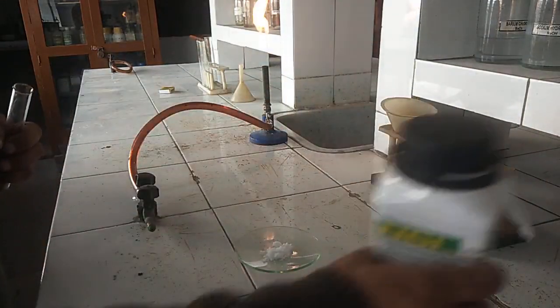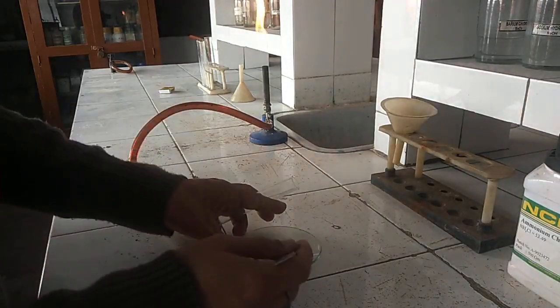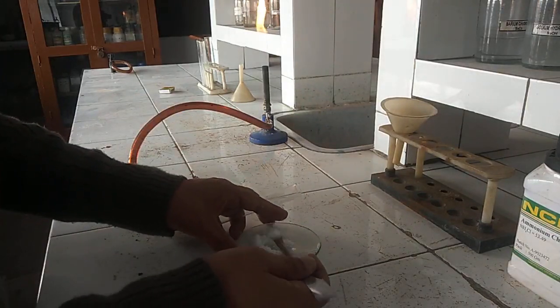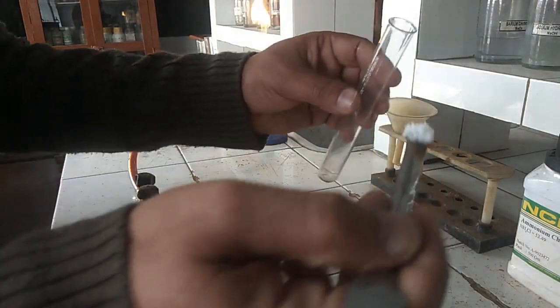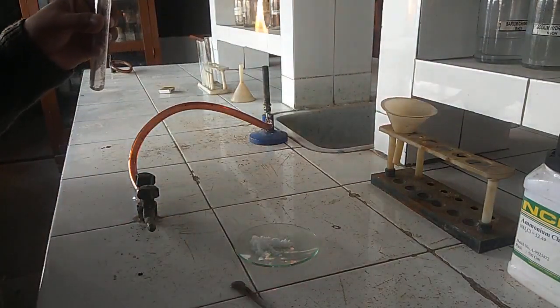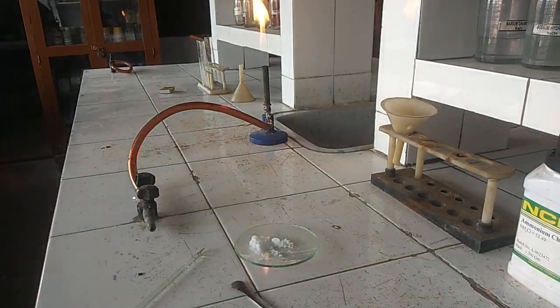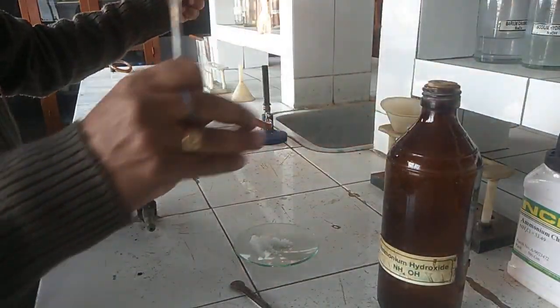First of all, we will perform the preliminary test. We will do a dry test to check the presence of chloride ion. For this, we will take a small amount of salt in a dry test tube with the help of a spatula. Then we will heat this over a Bunsen burner. For this, we will use a test tube holder.